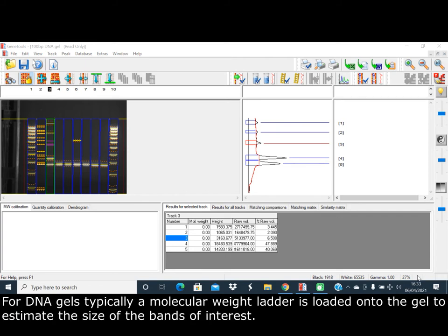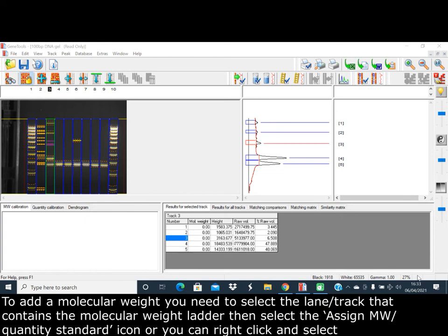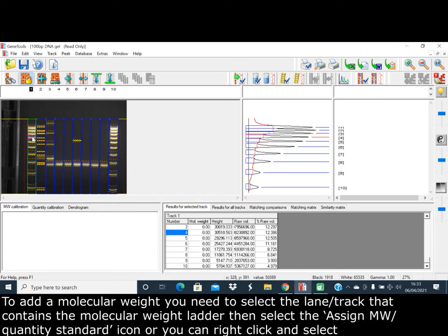For DNA gels, typically a molecular weight ladder is loaded onto the gel to estimate the size of the bands of interest. To add a molecular weight ladder, you need to select the lane or track that contains the molecular weight ladder and then select the Assign Molecular Weight/Quantity Standard icon.